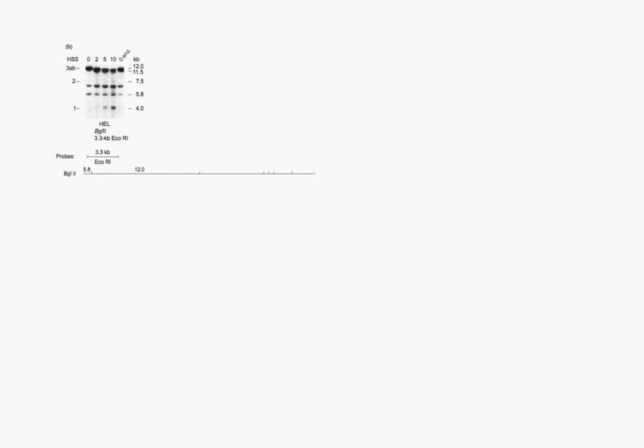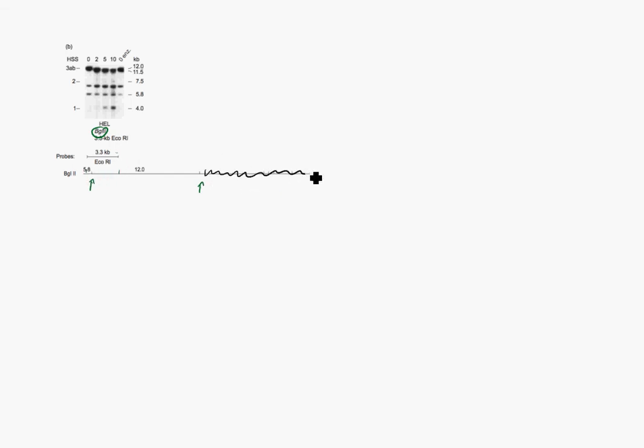It also has cut sites down here, but remember, this is the probe they used, which only binds in this region. And so all of this over here, we're not really going to have to worry about. Let's look quickly at what they got on this gel. So they have 12 and 11 KB bands, just like before. Or 12 and 11.5. And so those are going to be downstream of this, or they're going to start with a restriction enzyme cut right here, and go to a hypersensitive site here. This is going to be our 12 KB, and this is our 11.5.